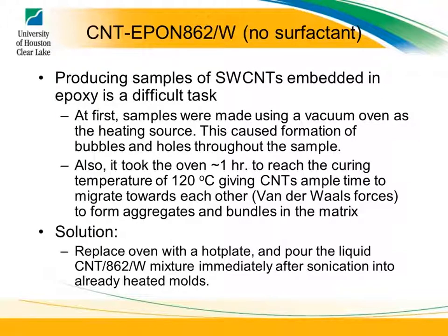Let's see if we can get right to the point where the viscosity drops, and it's very liquidy, and then all of a sudden it hardens. Very interesting type of process. So we replaced that with a hot plate, and just warmed everything up to the right temperature, and then tried to pour our mixture right onto molds that were already heated, so that we could get it to cure as quickly as possible.